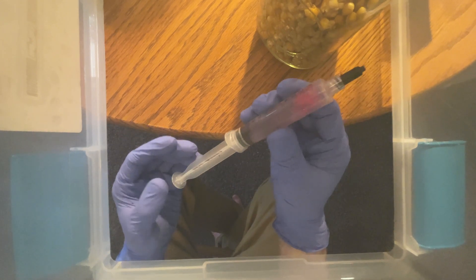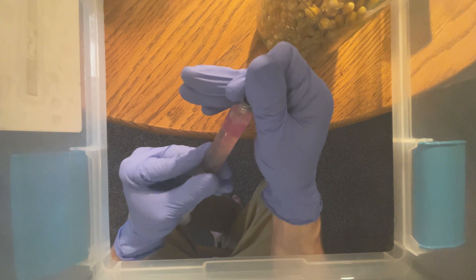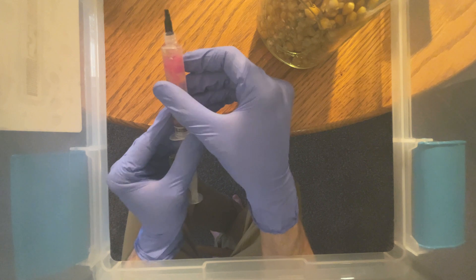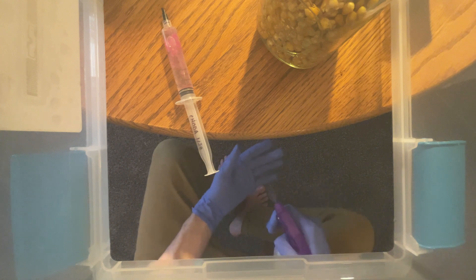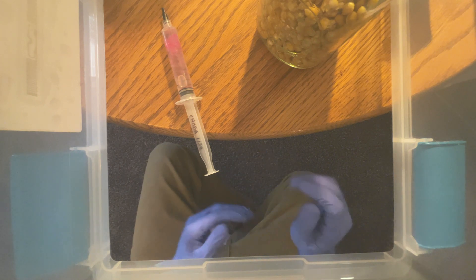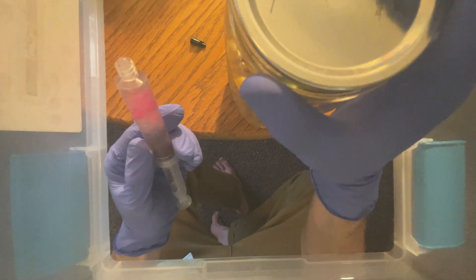We are going to take the liquid culture syringe and stage it as well for inoculating. First up, make sure to shake it up so that we can spread out the mycelium. I myself didn't shake it hard enough, but there seemed to be some mycelium in every inoculation so I wasn't worried. After the luer lock cap is off, re-iso your hands and you're ready.